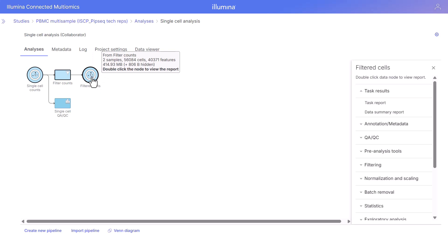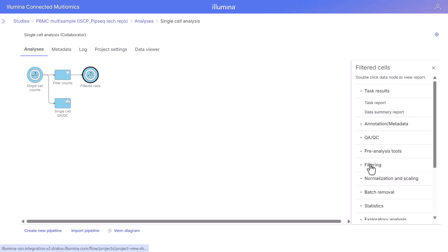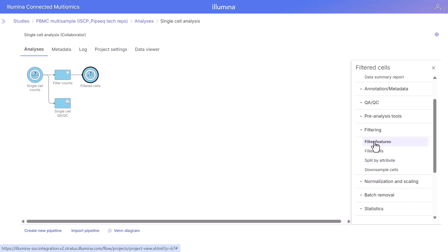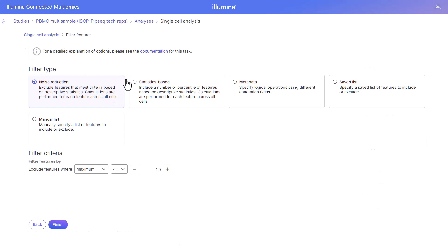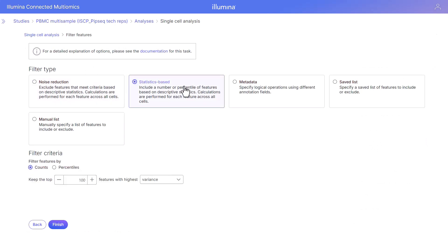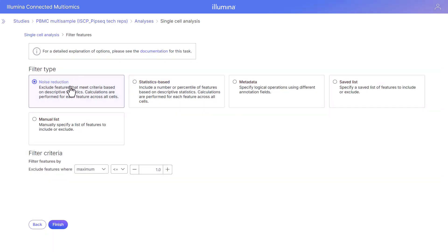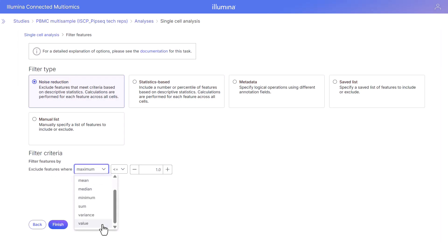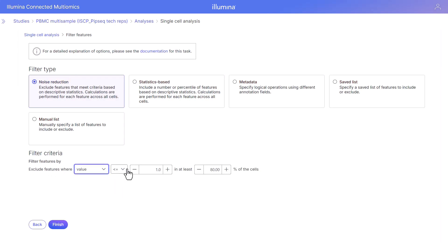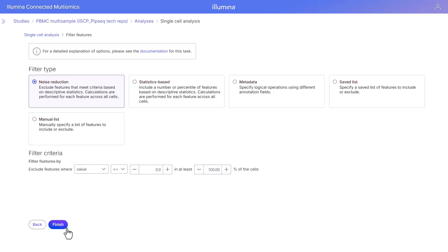Now we are going to filter our features. We're going to go to the task menu and look at the different filtering options. We're going to click filter features to filter our genes. We have different filter types to select. Today we're going to do a noise reduction filter and exclude the features or genes where the value is less than or equal to zero in all of the cells, and click finish.